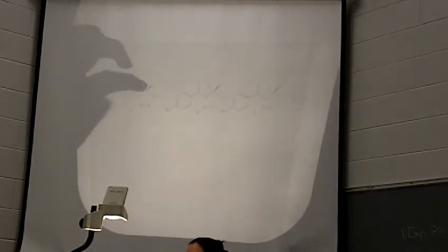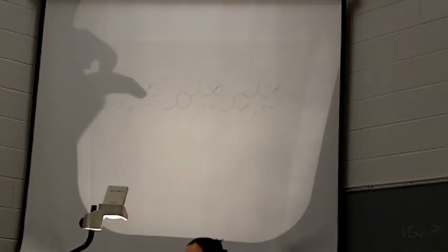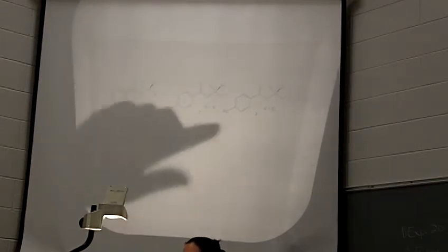and garlic, which is not really a fabulous thing to do. So we want to synthesize these compounds instead of actually extract them. And so what we are going to do as technicians in this pharmaceutical lab is we're not going to synthesize these specific compounds quite to the point that they're at, but we're going to synthesize the analogs, the precursors to these compounds. That's what we're looking to do, okay? So just keep this in mind as the goal of the project, because when we get to the end again, we'll have to remind ourselves of what we were actually trying to do, all right?